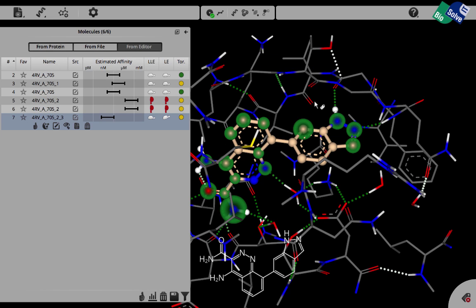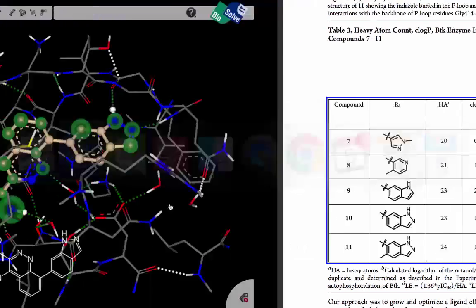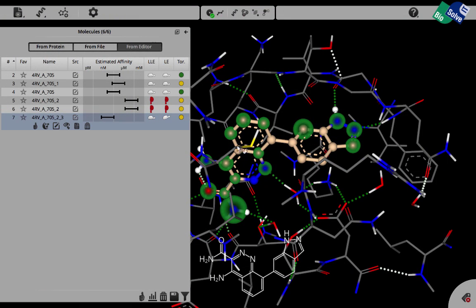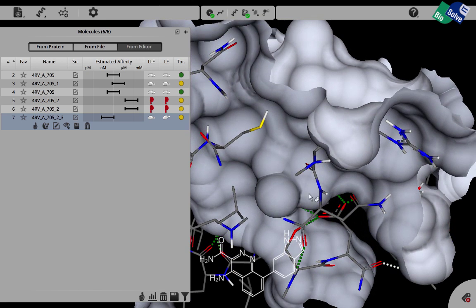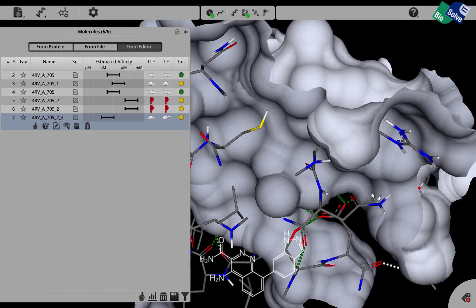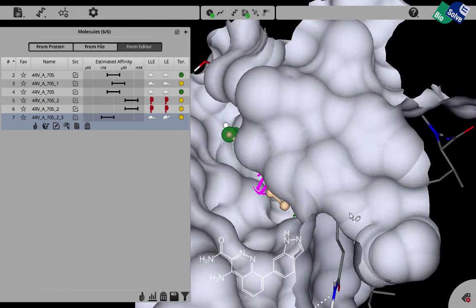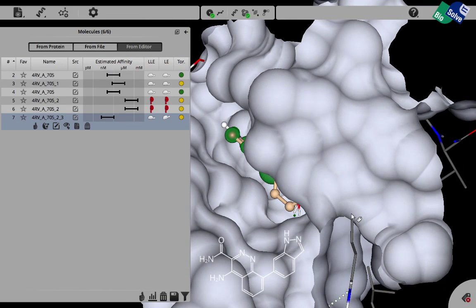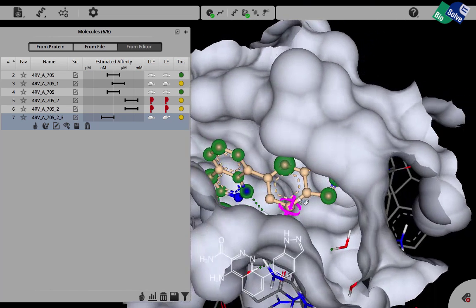The last thing that Takeda did was they introduced the methyl group in the ortho position here. And when we look at the surface, we can see that there is also an underutilized smaller subpocket here, which is directly in the extension direction of this vector.